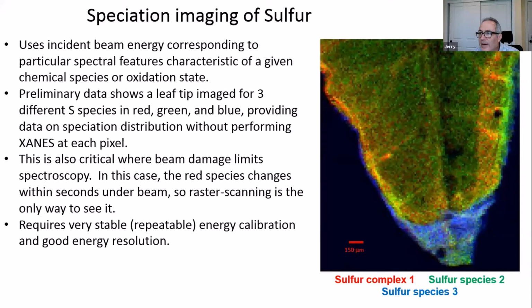Okay. I have a somewhat related follow-up question, which is there's been a couple of talks in this series about the transition edge sensor arrays. And you would have enough flux, certainly, to use those as your higher resolution detection. And I'm curious if that's something you've thought about. It's something we're starting to think about, because that does seem like a very attractive option. The challenge again is the interface to the helium chamber, but that should be manageable.